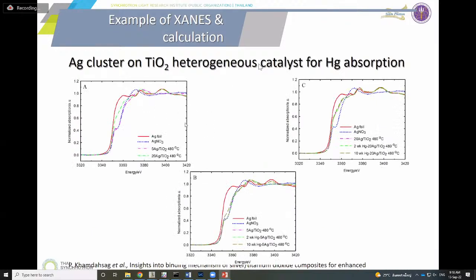It can be summed up that the silver doped in the titanium dioxide structure shows up as 1+ charge. So silver 1+ instead of neutral silver, silver 0, which is strange because they doped silver 0 in, and silver will not interact with anything. So how do we come up with silver 1+?